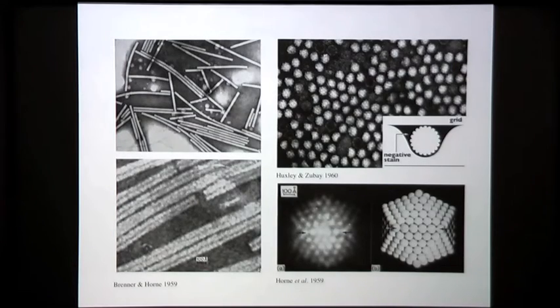And the first development in specimen preparation and preservation was the development of what's called negative staining. Here, again, a field of various kinds of viruses, and it turns out, because viruses are fairly readily available and they're nice particulate specimens, they're robust, the study of viruses, although it's important in itself, has actually underpinned quite a lot of the technical developments in electron microscopy at each stage. Viruses have often been used as a test specimen.